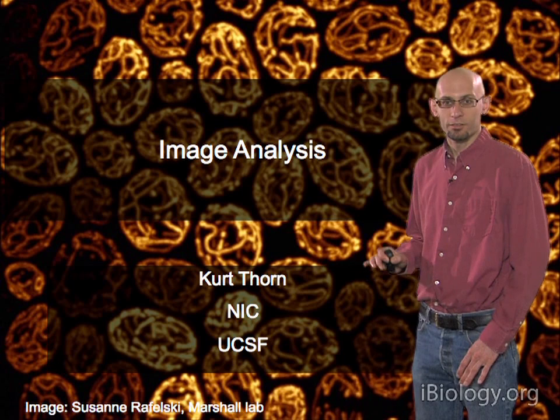And so here's a kind of artificial example where we've taken an image, a noisy image. This was actually a computer-generated noisy image, but the principle is the same for real noisy images. And you can see there's structure in here, but it's kind of hard to see it. And when we do this Gaussian smoothing filter, you can see these structures are now easier to see because we've averaged out some of the noise, but we haven't averaged out the real structures by as much because they're about the same size as our averaging filter.